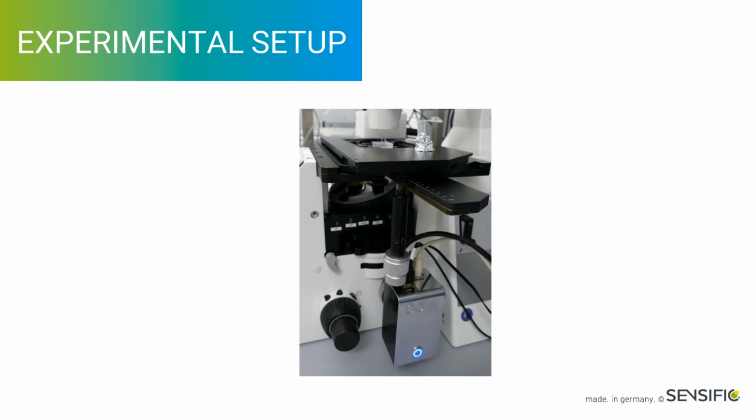Let's see how this looks in reality. Here you see a photograph of our microscope. The microfluidic chip is mounted on the sample stage, and ODIN is attached to a side port. Due to the compact design and the standard C-mount, ODIN is compatible with most microscopes.